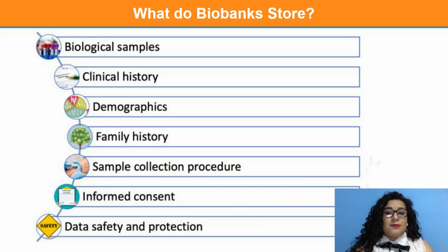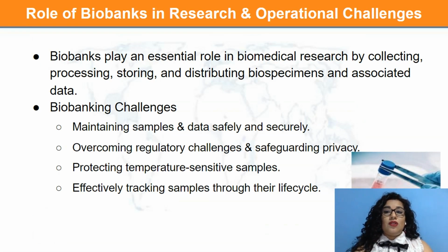So, as we can see, biobanks play an essential role in biomedical research. It serves like a library for researchers. The time and resources needed to recruit new participants for each research study are greatly reduced because the samples and the corresponding medical information are available in just one place. So, by making sample collection and patient recruitment more efficient, better studies can be performed in a more timely manner, so researchers can just focus on the research and not on recruiting patients or looking for samples.